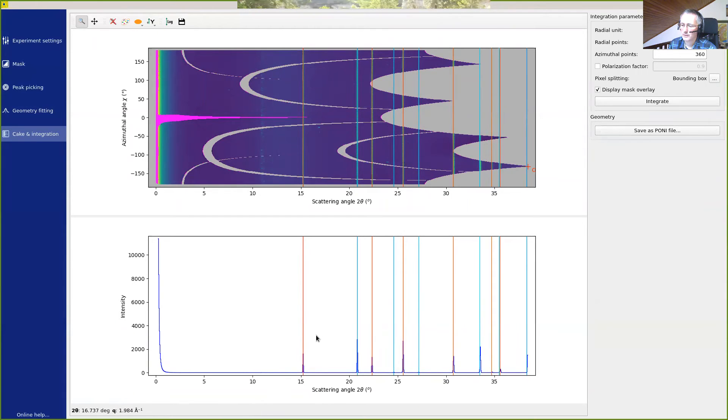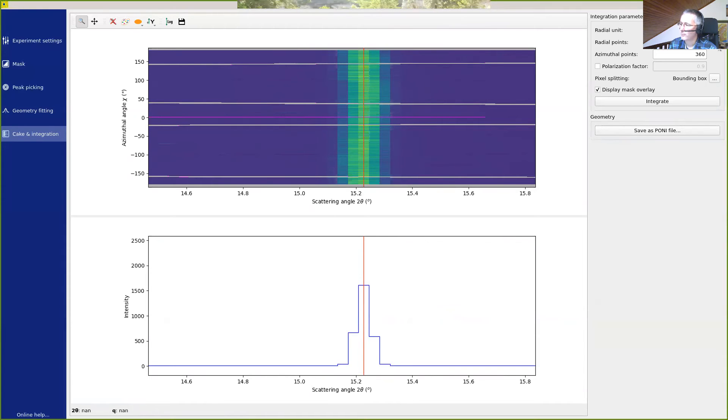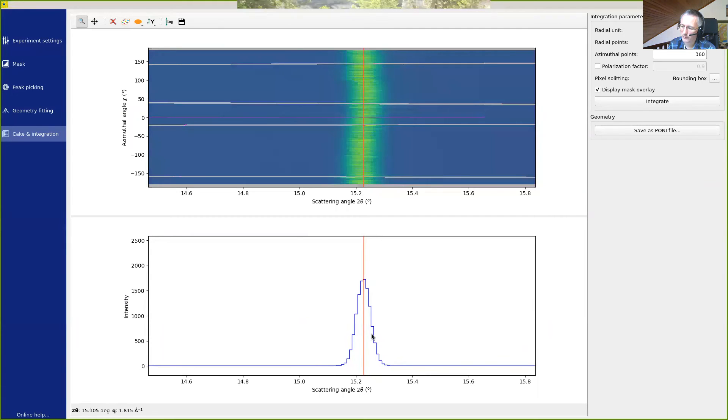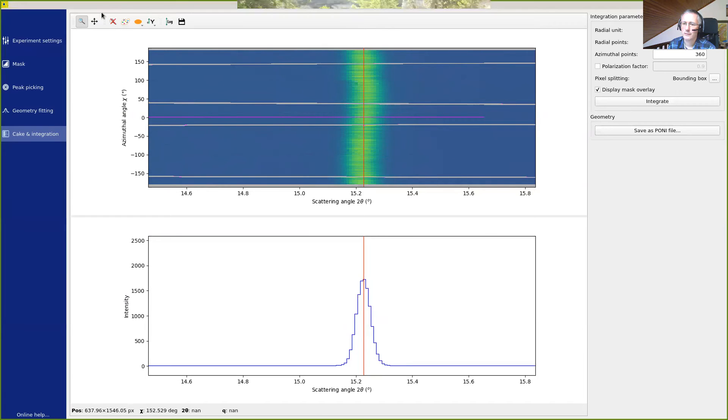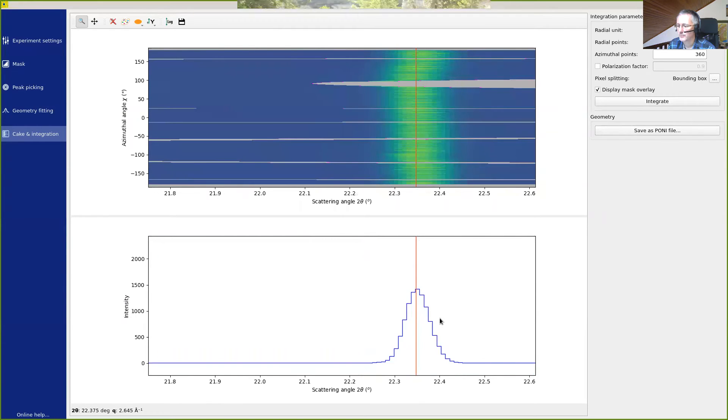We can see that if we zoom onto the first ring, we have a fairly bad description of the peak. This can be improved by changing the number of radial points, for example, to 4,000. And this will re-perform the integration. We can see again the peaks, which get a better shape.